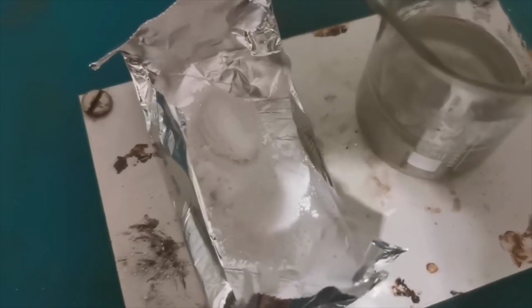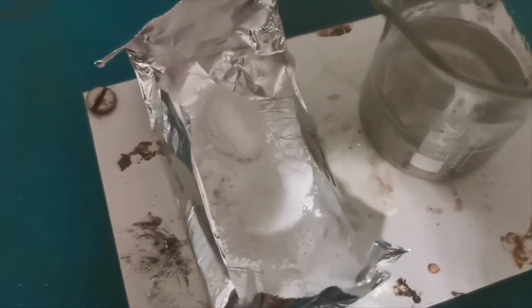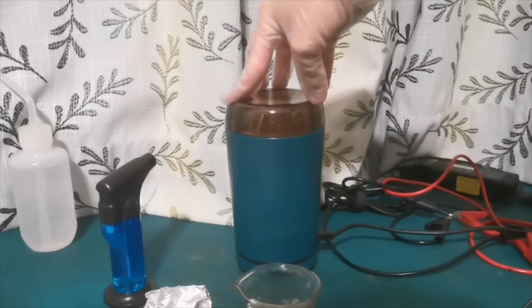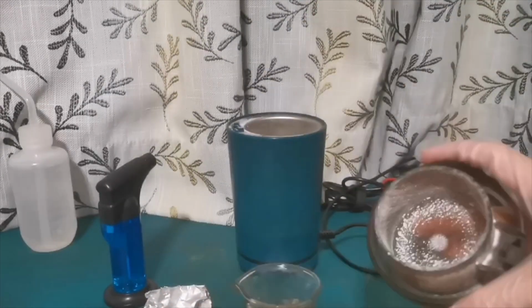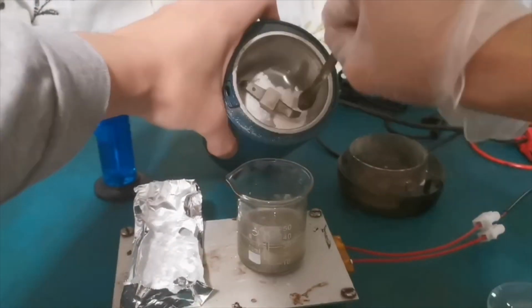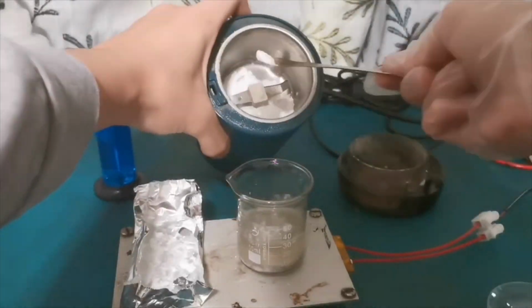Anyways, I then replenished the cell with some more lithium chloride. I dried some of the salt on a hot plate, pulverized it, and added it to the electrolyte solution while it was heated. I found that heating the PC really helps increase the solubility of lithium chloride in it and greatly speeds up the initial rate of electrolysis.